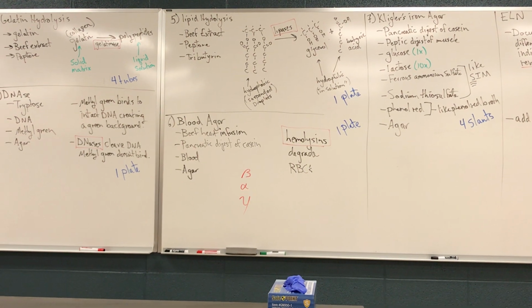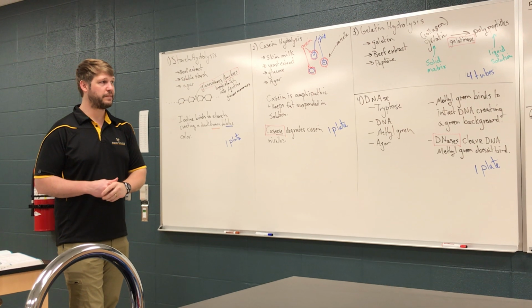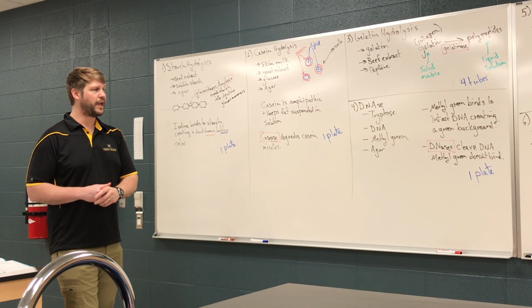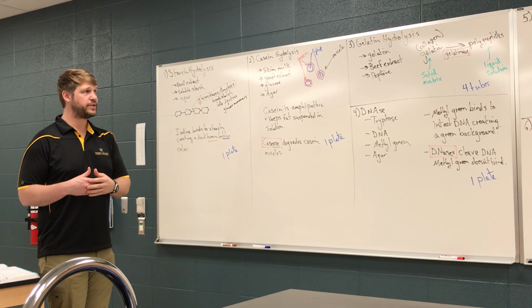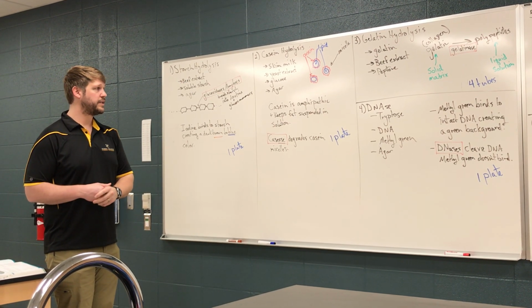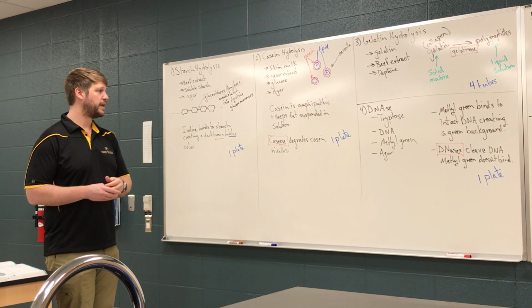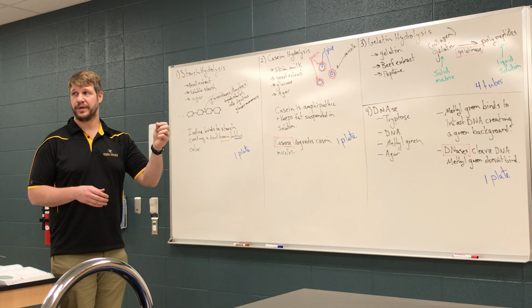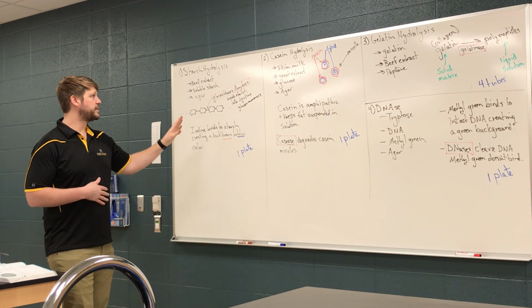in microbes. A number of these are plates. A couple of them are in a different format. We'll talk about those as we get there. In some cases, breaking something down, you can actually just see a change in the media itself, as in gelatin hydrolysis and in casein hydrolysis. In other cases, we will add or have added an indicator that'll show the degradation products. Okay? So we'll just start here with starch.